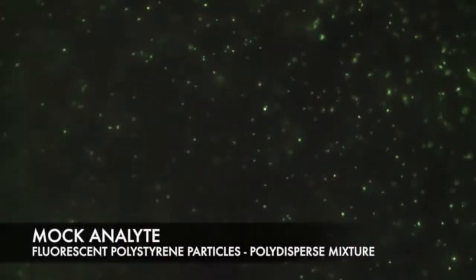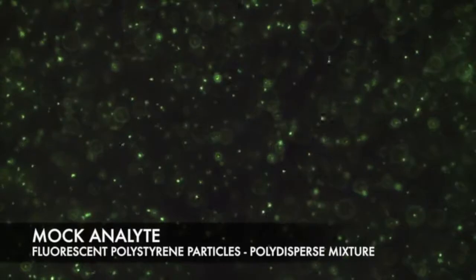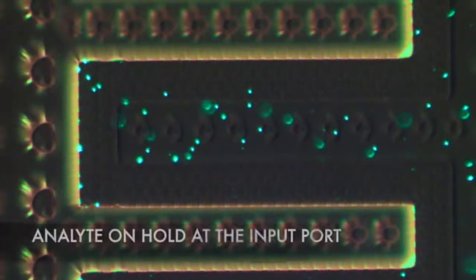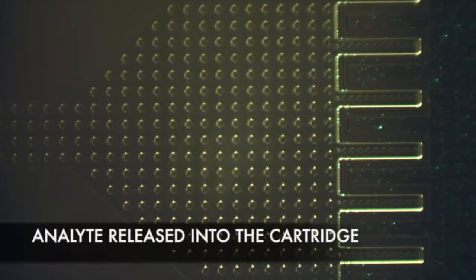Let's take a look at what's going on inside the actual measurement cartridge with the help of some fluorescent particles. So here you see the analyte on hold at the input port. The structure to the right is the filtering mechanism that's used to filter out particles that are too large for the nanoconstriction.